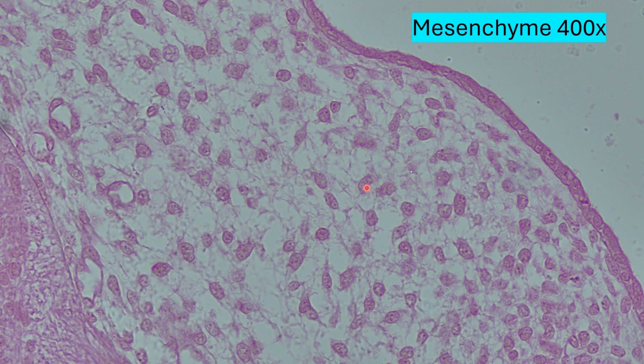The oval shapes right here, all of these, those are nuclei of cells, and you can see a bit of the cytoplasm. They can differentiate into most cells of the connective tissues. Without getting too technical, such as excluding blood cells, it is the link between connective tissues from a developmental standpoint, where we see cells and an extracellular matrix. Let's jump in and explore the nature of connective tissues.